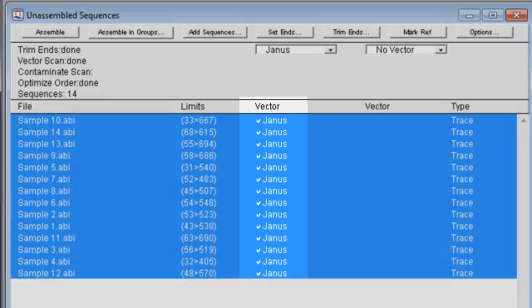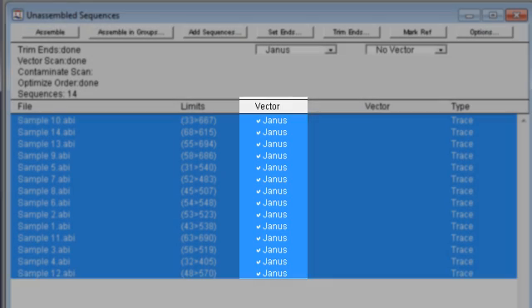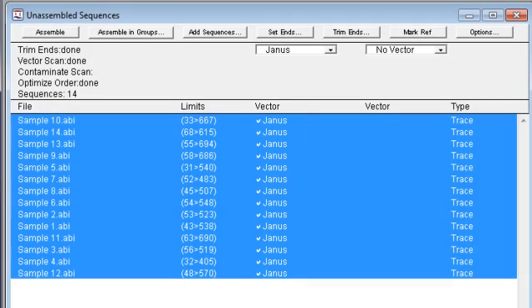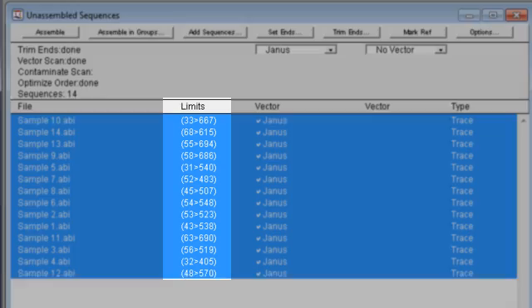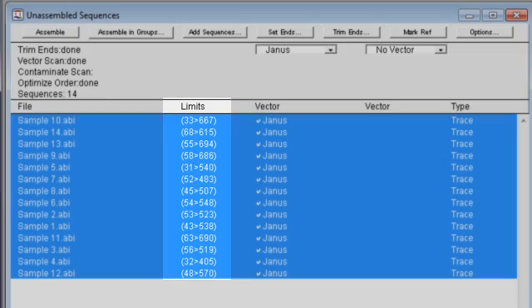After trimming is completed, you can see that there is a checkmark next to the word Janus, meaning that that vector was found in each of my sequences. You can also get an idea of how much sequence was trimmed by looking at the coordinates in the Limits column.